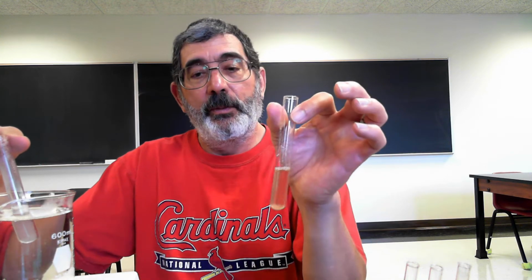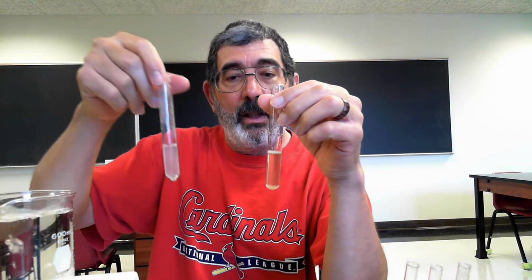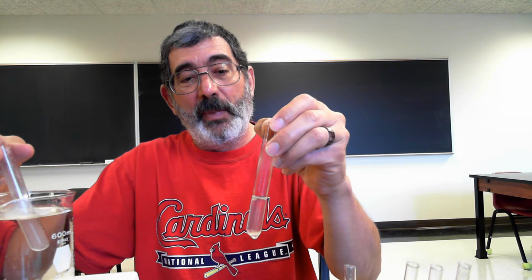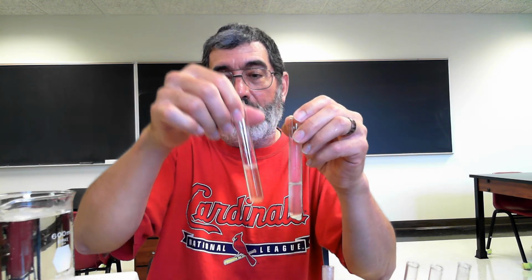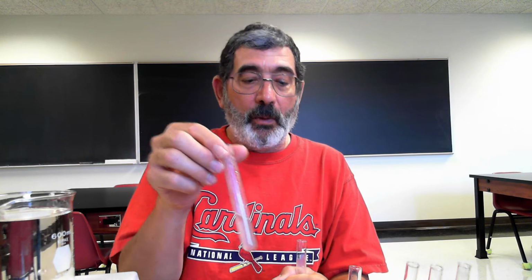So again, here's room temperature. The brown color indicates our enzyme is functioning. Hot water, kind of cloudy, but no brown color. Cold water, maybe just the slightest hint of a brown color. I'm going to go ahead and put this hot one aside. So comparing these side by side, though, notice the room temperature one is obviously browner. So I'm going to hold this in my hand for a minute. Let's go back and talk about the hot water one. You know, often if we want to speed up the rate of a reaction, we add heat. In this case, it didn't help.